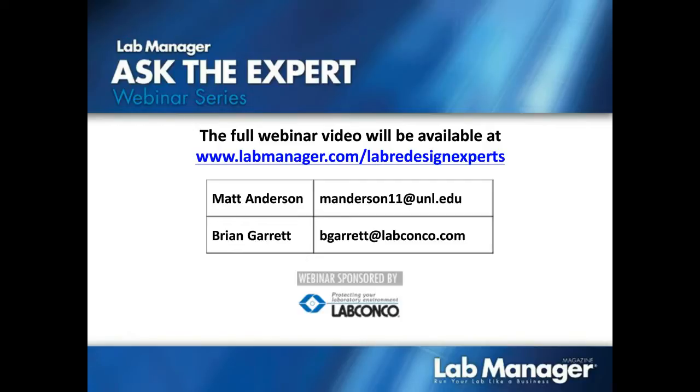Well, you may not necessarily. It depends on who's asking the question. If you're coming from a lab manager standpoint, I would contact your health and safety department, EHS or whatever, at your institution. They should be familiar with those wastewater regulations as far as what could go down the sewer and what can't. But you can also probably contact the wastewater utility in your area directly and find out what is allowed and what isn't. A lot of times those are regulated by EPA as far as what they consider hazards, but the wastewater treatment area will generally have specifics of what they allow and what they don't allow, and it may be more restrictive than EPA or less restrictive. Well, it's not going to be less restrictive, but it may be more restrictive based on the methods that they use to treat the water in the city.